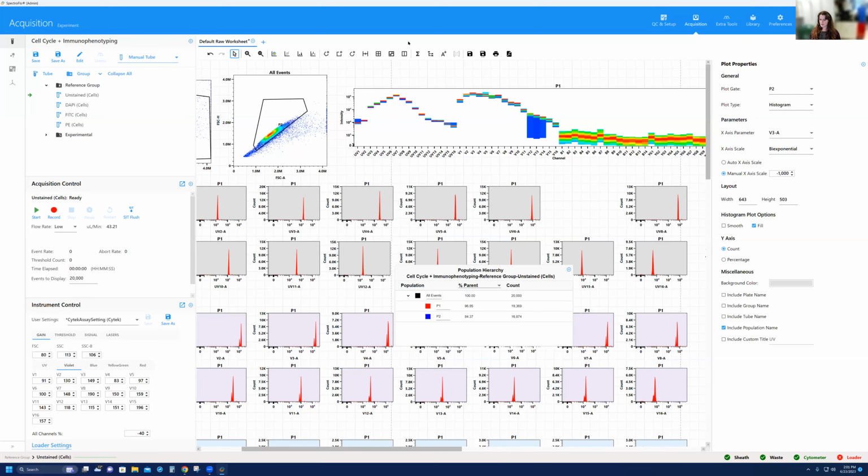It's easy to get lost, and then you're changing the overall pattern of that fluorochrome and the spectral profile. Okay. I hope that makes sense to everyone. If that doesn't make sense, let me know.